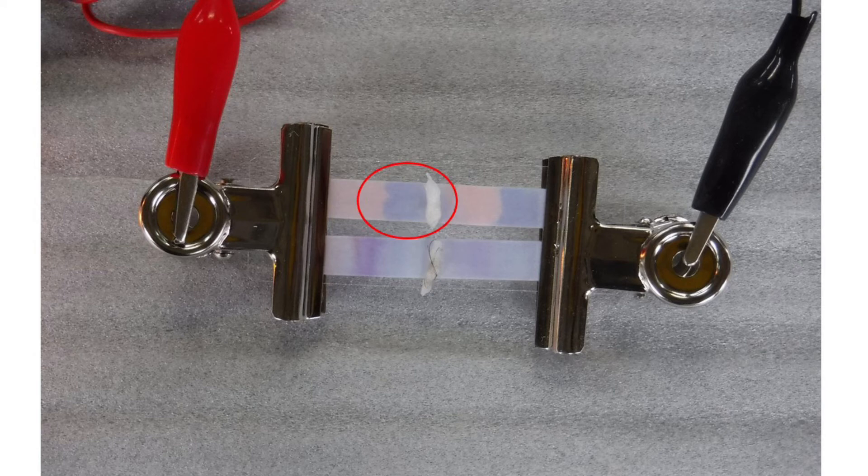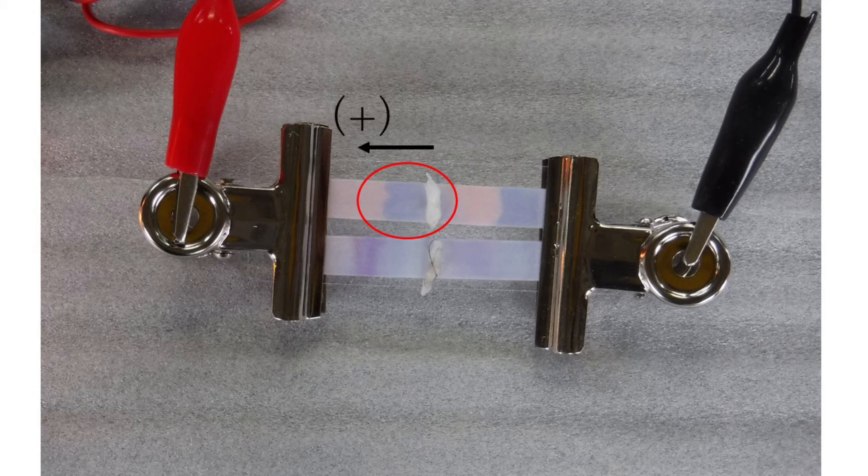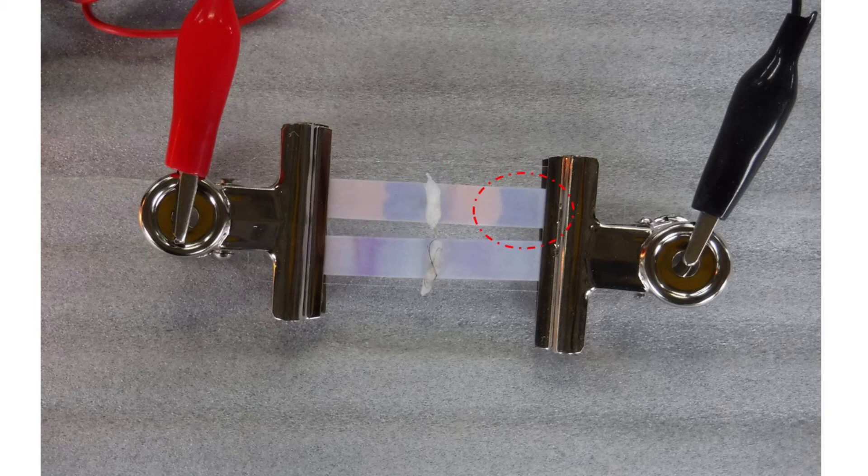The blue part showing basicity moves to the positive electrode on red litmus paper. Part of the red litmus paper at the negative electrode turns blue because hydroxide ion is produced at the negative electrode.